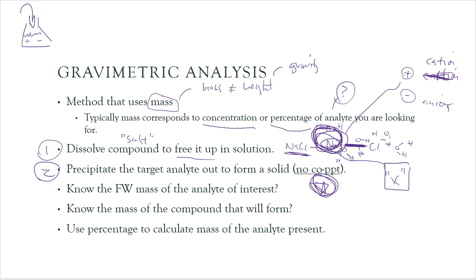Well, again, let's say I'm picking sodium. So this extra reagent is going to come in and it's going to start to grab that positive sodium piece. And when it does that, a precipitate clump begins to form at the bottom. Okay, well, I'm pulling that analyte out that's of my interest.